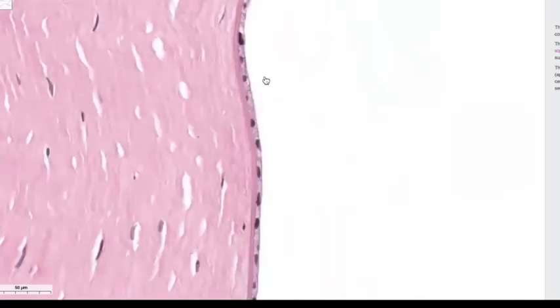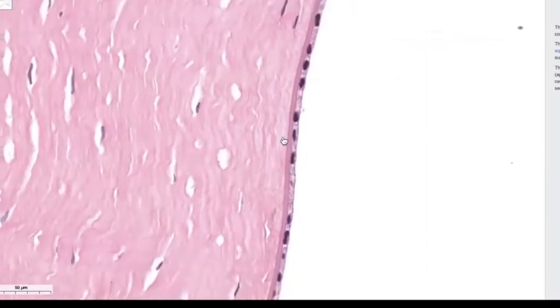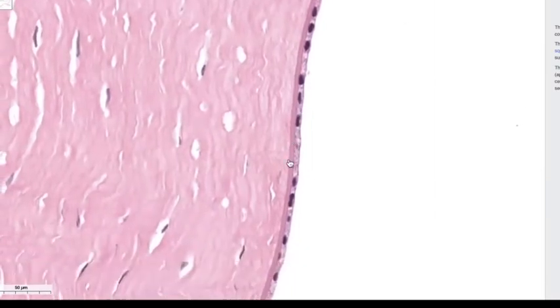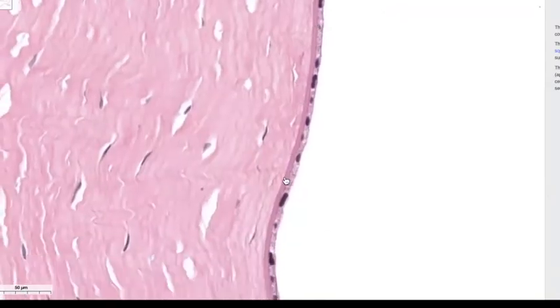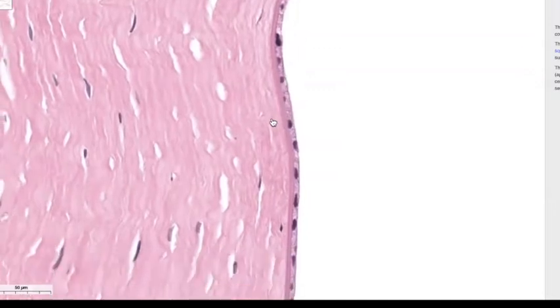Not that I'm going to use this very slice. I might use this one, right? It doesn't matter. I might flip the image a little bit so it's at a different angle, but once you've looked at this a couple of times and you have pictures of it for study, it won't be difficult.